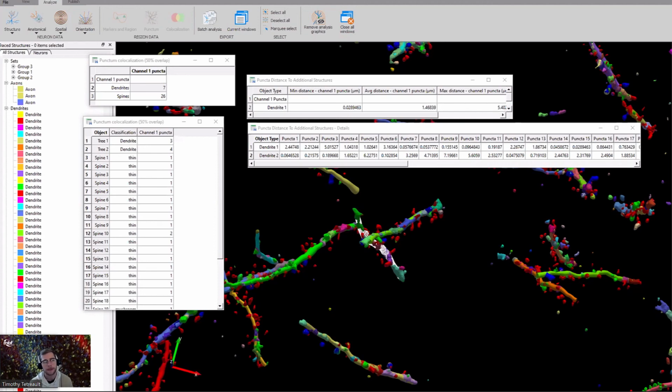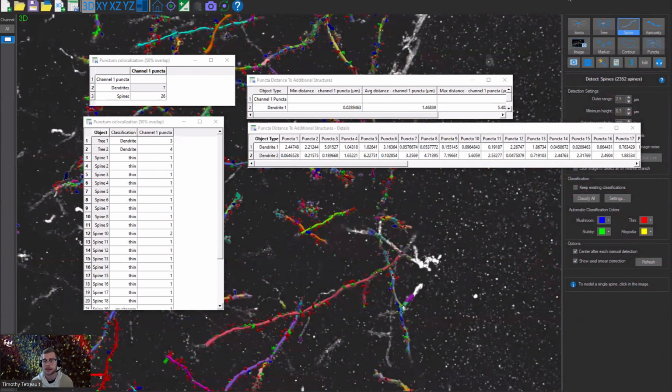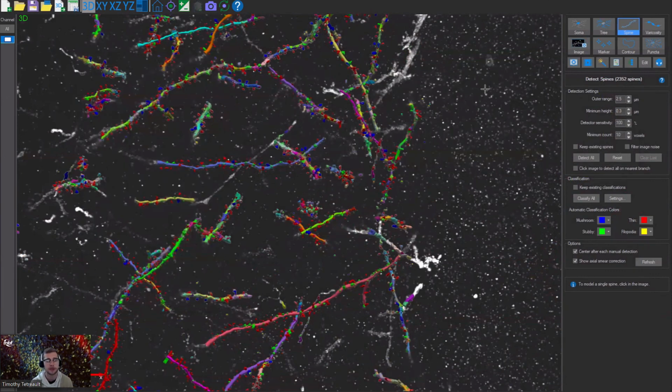If not, there are always filters that we can apply, and in this case, I would probably try to focus a little bit more on maybe the closing filter. That would probably be the best way to do the detection that you're looking for if the detection as it is doesn't necessarily work for you.